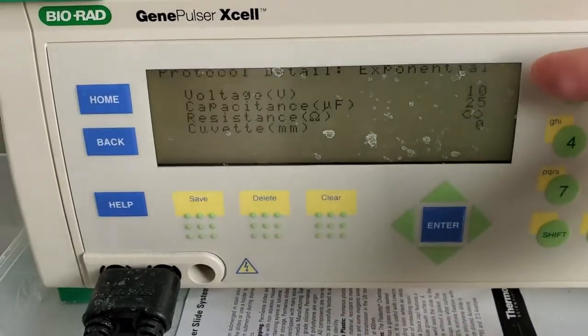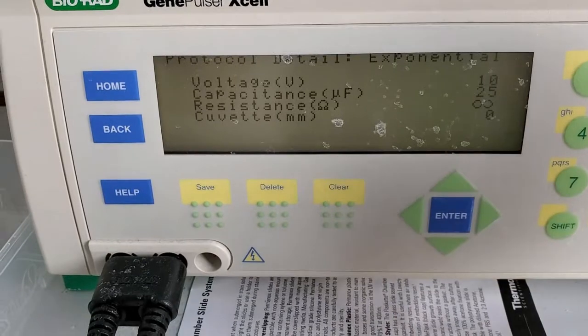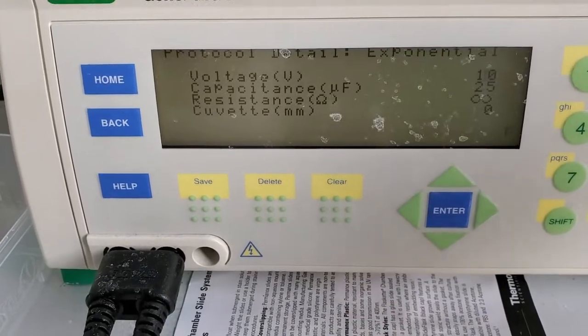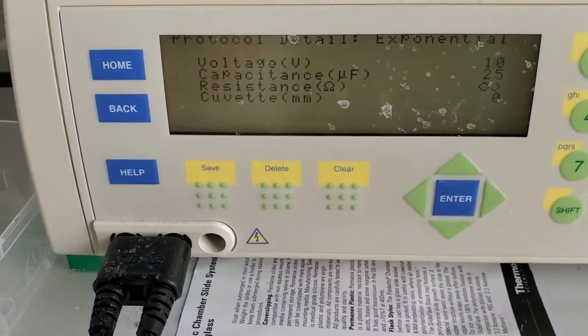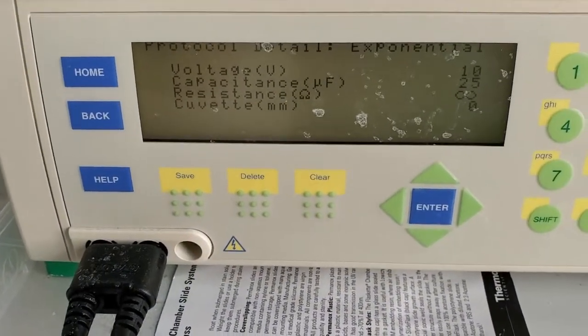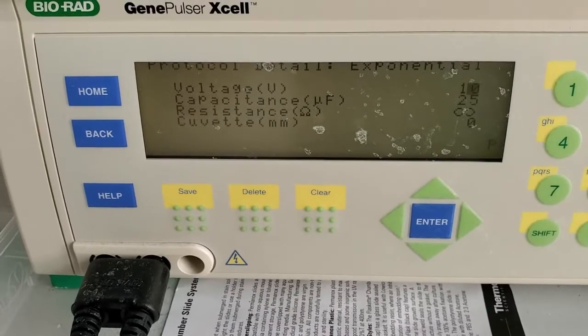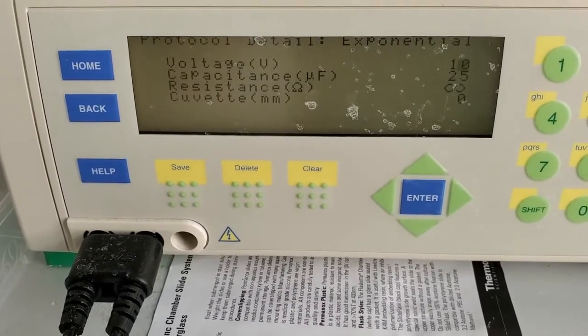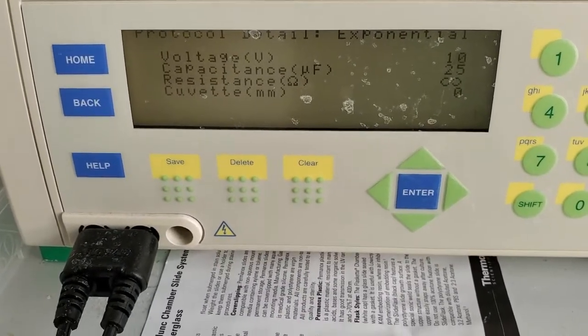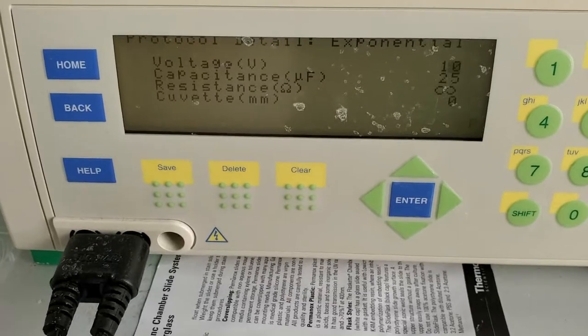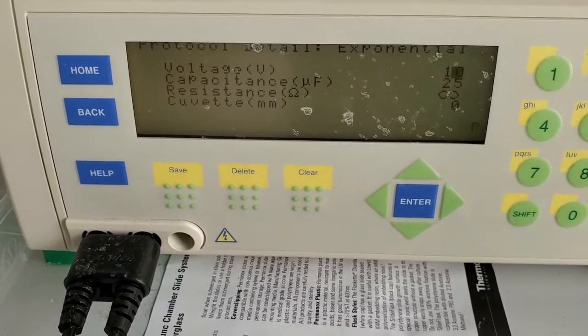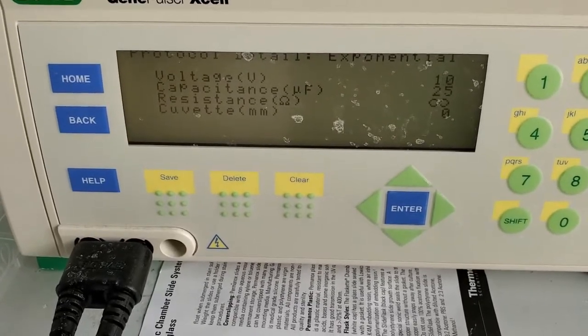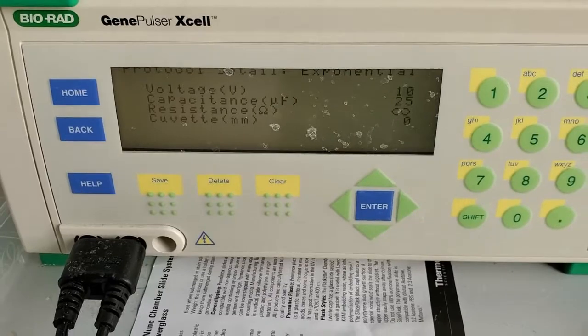And here you can change all your variables. So voltage would typically probably be in the range of one to two kilovolts. Your capacitance might be one to ten microfarads, somewhere in there. Resistance would probably be a couple hundred ohms. And the cuvette size would probably be one millimeter typically.